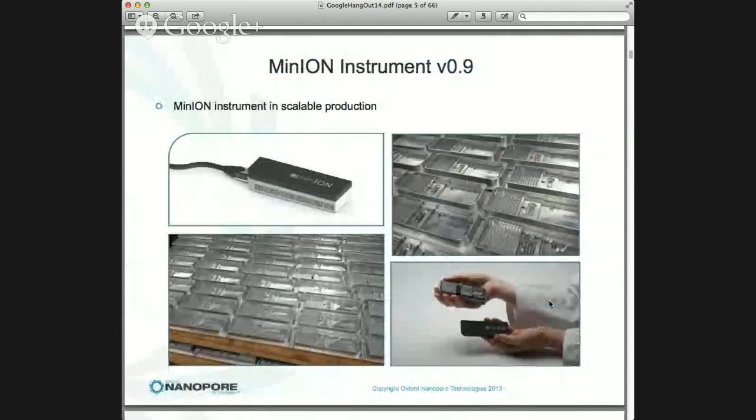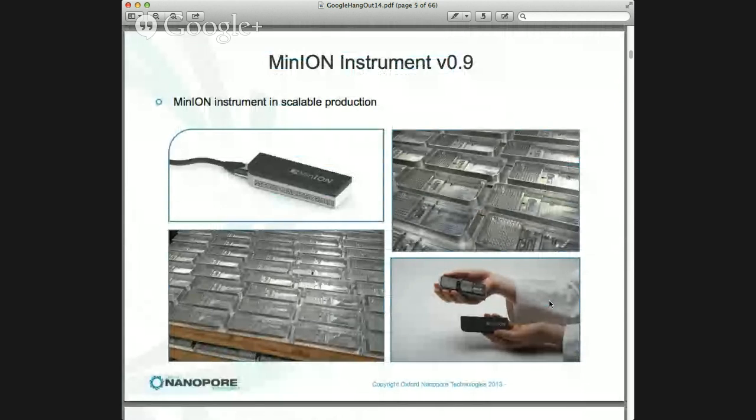Now, the device that's out, the one most people are familiar with, that I'm going to focus on today, is called MinION, universally mispronounced, and an awful pun, and of my invention, so you can blame me for most of the company naming schemes. Now, MinION is a USB DNA sequencer. It is obviously portable. It's designed to plug into a laptop. Of course, it's obviously radically different from any of the DNA sequencers on the market.